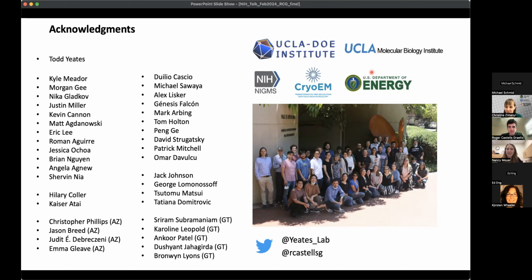Okay. We've got a few more questions that just came in. Complementing the talk, can you explain the basic workflow to get to the final structure you showed? Like the sequence of jobs in, for example, CryoSpark. And I think maybe they're asking about the basic steps of the focused refinement to see the appendage proteins separate from the cage.